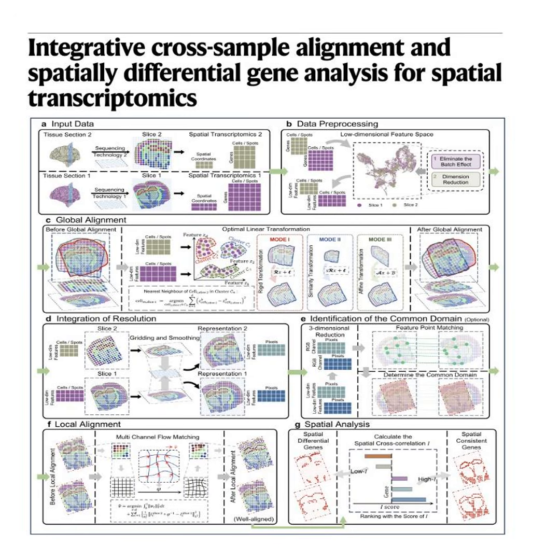And researchers used CODA to look at the regenerating brain tissue of an axolotl, specifically a region called the telencephalon, which is the cerebrum, the front part of the brain, just 2 days post-injury. That's so fast. Now, imagine the environment of a regenerating brain. It is highly dynamic and chaotic. Tissue is actively moving, dividing, and rebuilding in real time. It's a microscopic construction site.